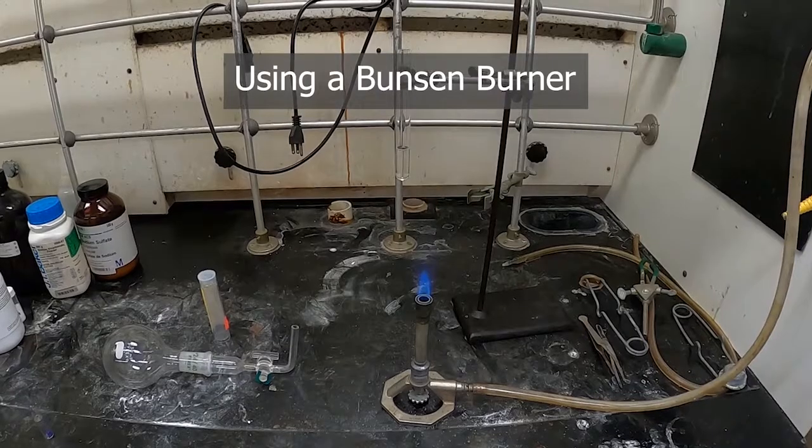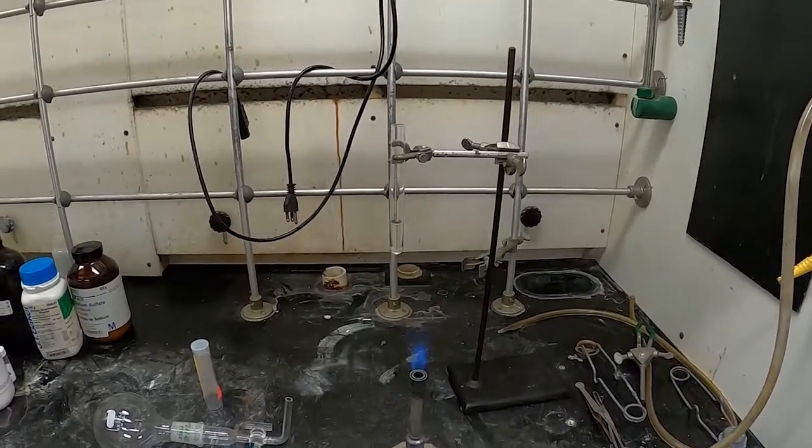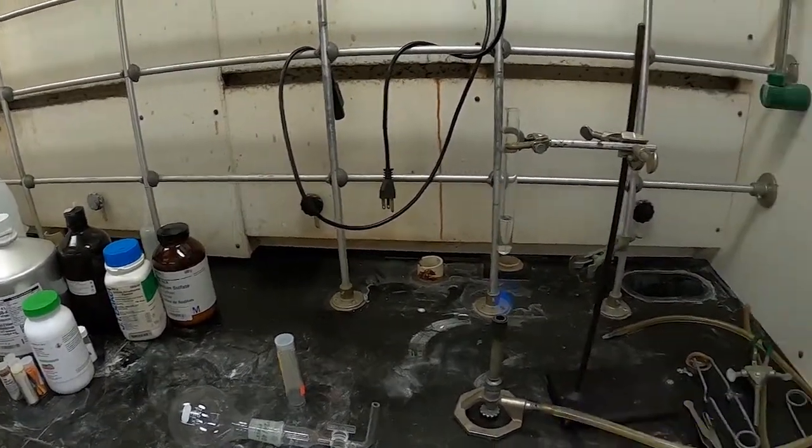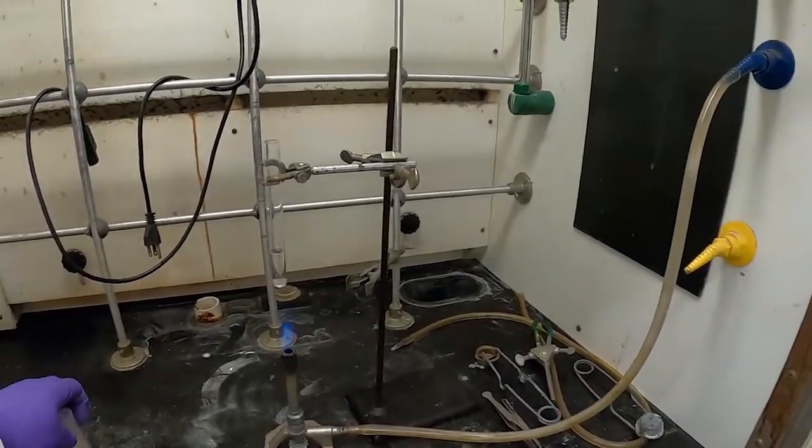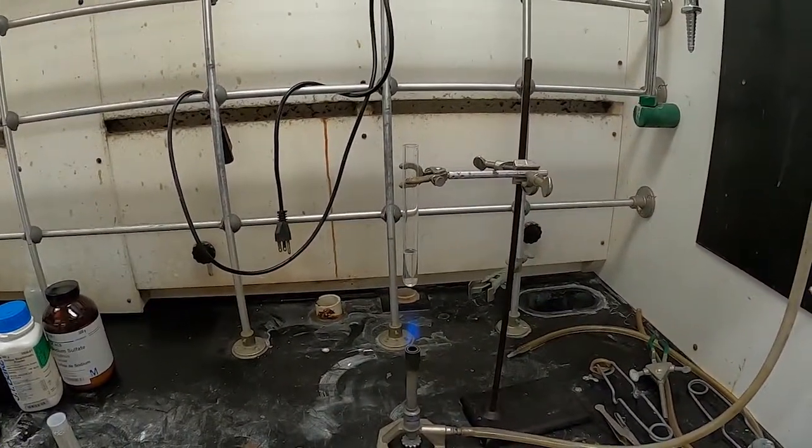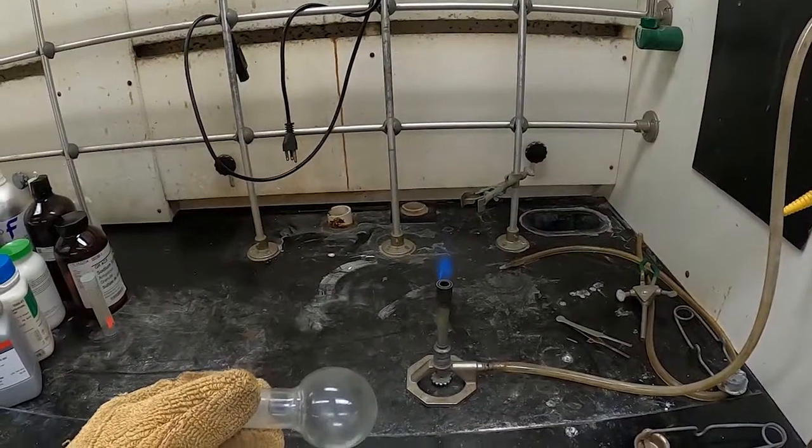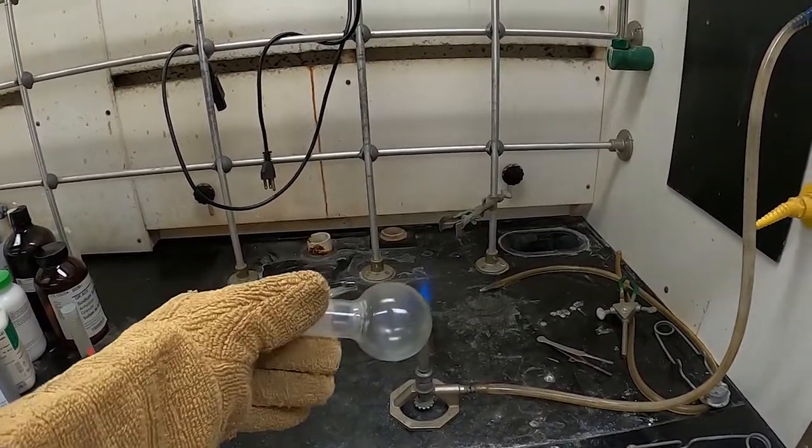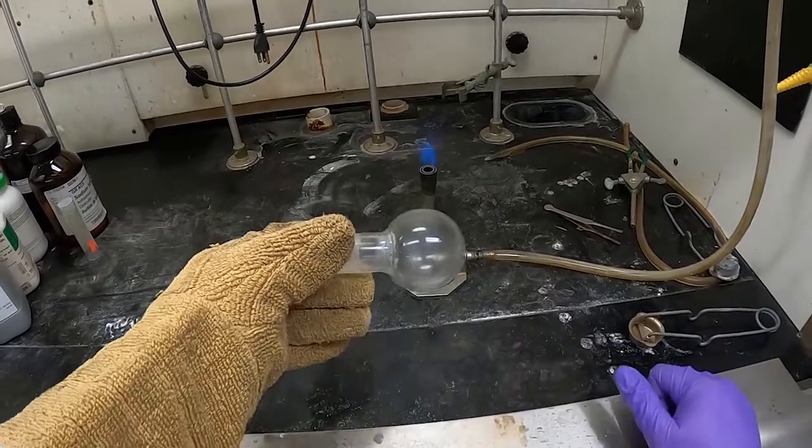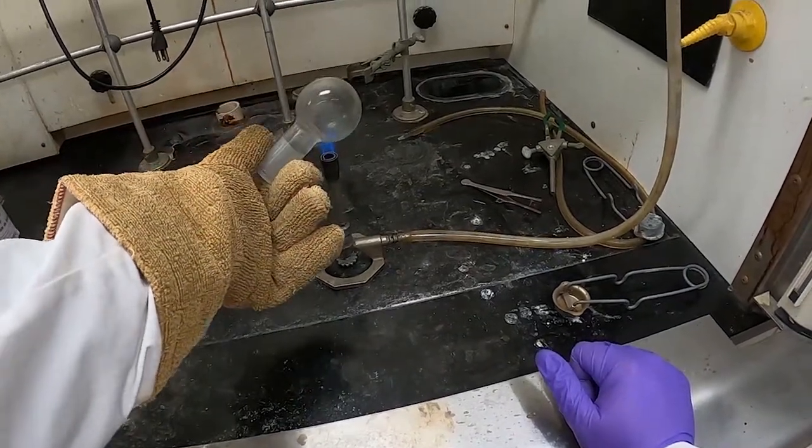Another method for heating that we have in the lab is a Bunsen burner. Now you have to have a gas hookup for that, but in places where that is available, Bunsen burners are often useful too. Bunsen burners can be used to do things like heat test tubes. Also they're useful for making capillary tubes to do NMR samples or other things where you might need to do a capillary tube, or to seal ampoules. One of the things that we can use a Bunsen burner for is to flame dry glassware. So if we have a piece of glassware that's got water or solvent in it, we can get rid of that by heating it over a Bunsen burner to drive off that vapor on the inside of it.